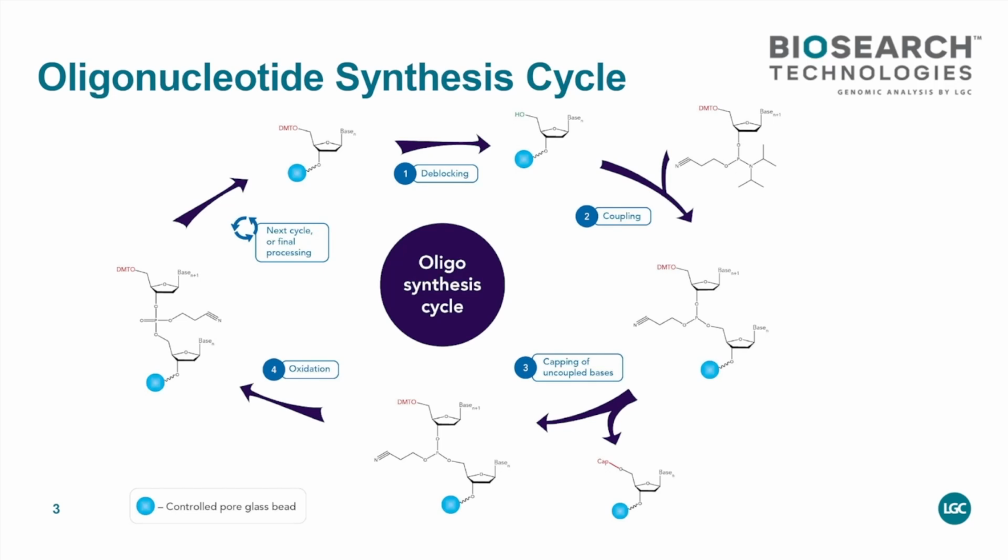When the chemical hits the bead, this bright orange color comes off. It's called trityl. What it does is activate this OH group for the next addition. The next addition would be putting the second base on, which has this cyanoethyl group. This base gets mixed with an activator, which could be ETT, BTT, or DCI. And then during this reaction, called coupling, the two bases are added together.